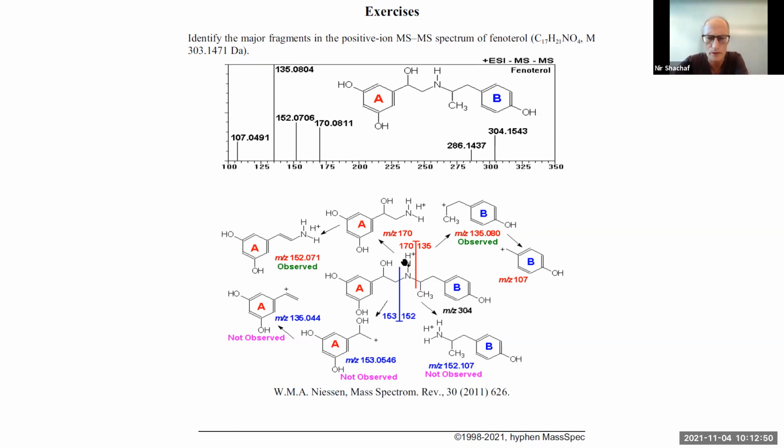So I have a general question about the MSMS fragments and what you call the accurate mass. So how accurate do you expect the MSMS mass to be in order to be usable? Because it's quite a critical point. If you compromise too much the mass accuracy, then all your chemical formula calculations will not be accurate enough to actually make a conclusion.